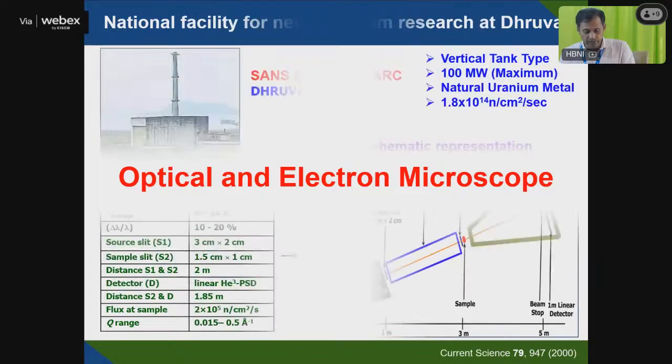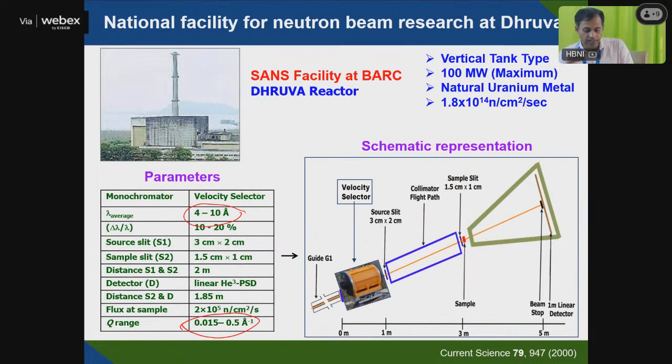Basically, with SANS and SAXS, this SANS study will take quite a long time, because in neutron scattering you have to scatter from the spin-carrying nucleus, so you have to do the scattering measurement for a longer time to get the results.